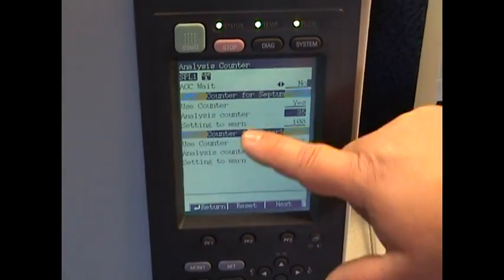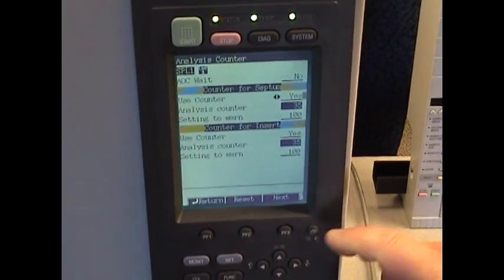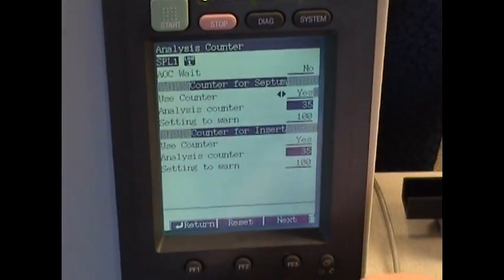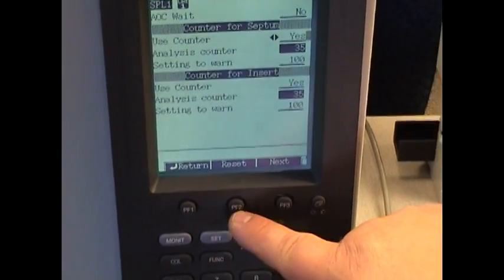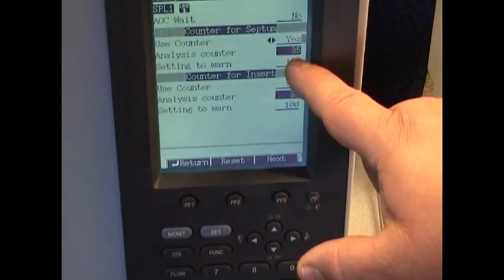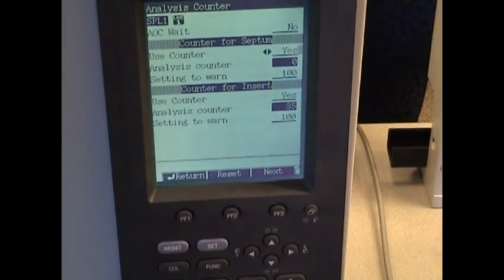But right here you see counter for septa. I'm going to toggle down. And down here in the options, PF1, PF2, or PF3, PF2 says reset. Now watch the number here. Currently I have 35. If I push that, it goes to zero.